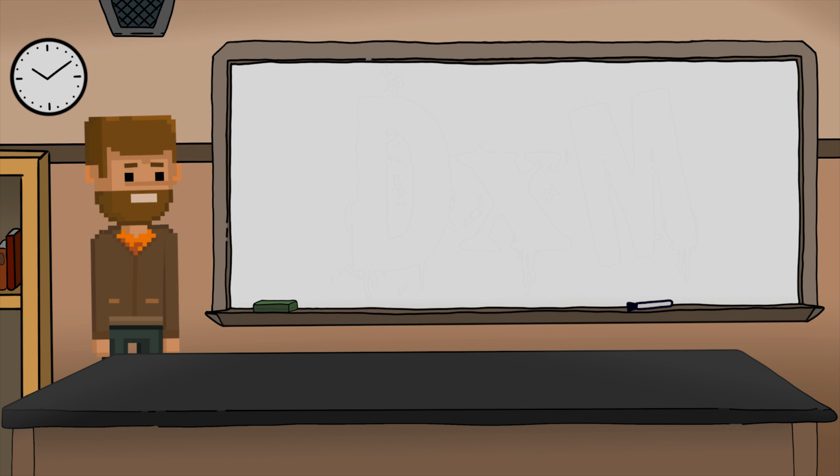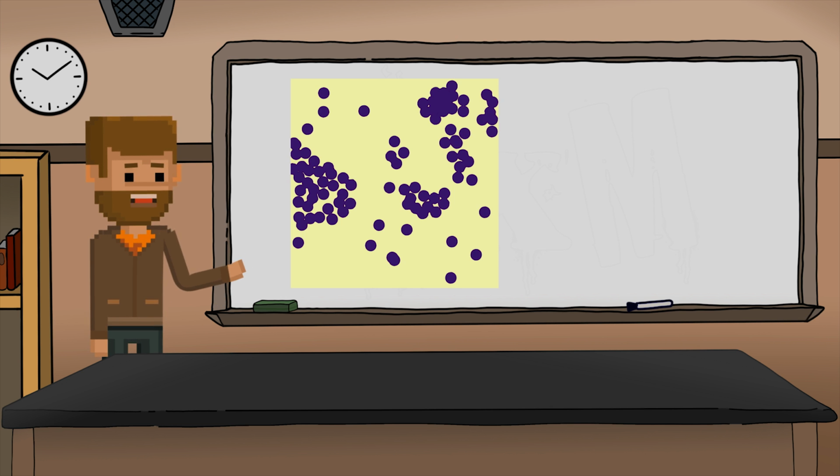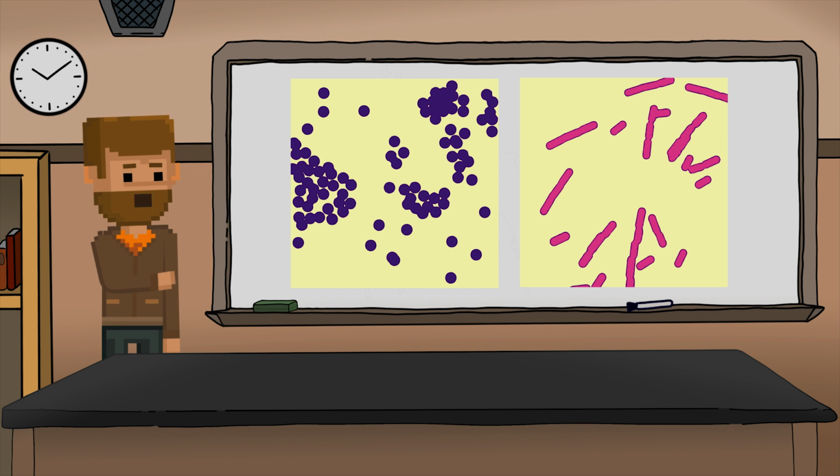As long as you followed these steps correctly, you should have a clear result. The gram-positive cells will retain the primary stain, Gram's Crystal Violet, so they will be blue or purple after decolorization. Gram-negative cells do not retain the crystal violet through decolorizing, and they will appear red or pink after counterstaining with Gram's safranin. So it's a good idea to memorize this now. Red means negative. Anything red or pink is gram-negative. Blue or purple is gram-positive.